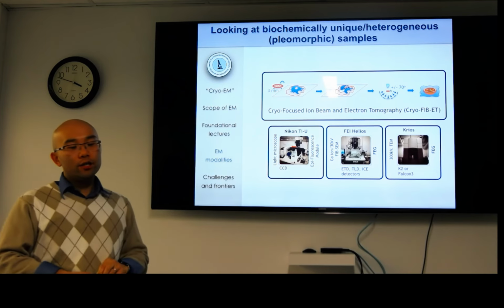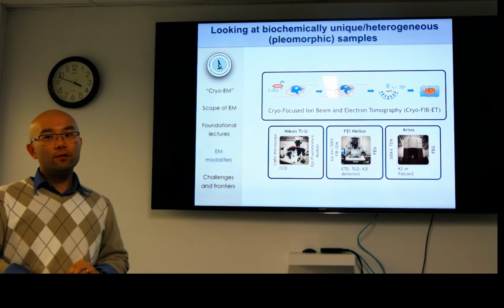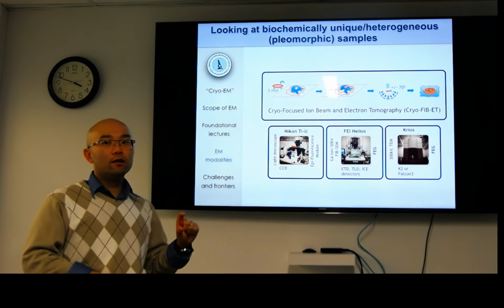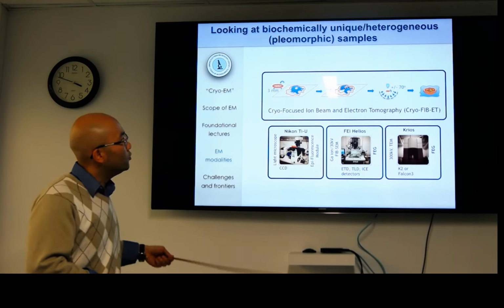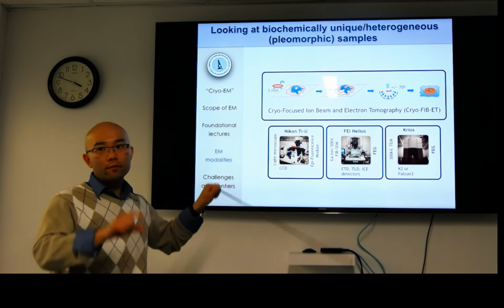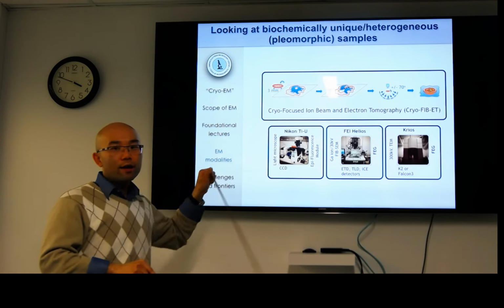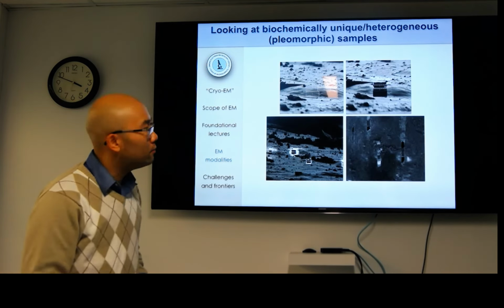So as I mentioned, there are techniques where you can bring single particle techniques into tomography. Let's say you're interested in the nucleus. Traditionally, the nucleus is quite thick in the cell, and that's very hard to take electron tomograms from. What we can do, using our FIB, is take a little bit off the top and bottom, basically thin your cells such that it's a sample amenable for classical electron tomography, take electron tomograms of it, and then from there you can apply single particle techniques.